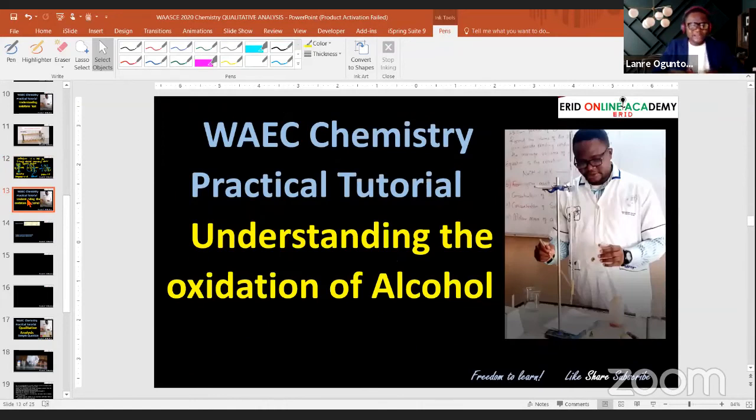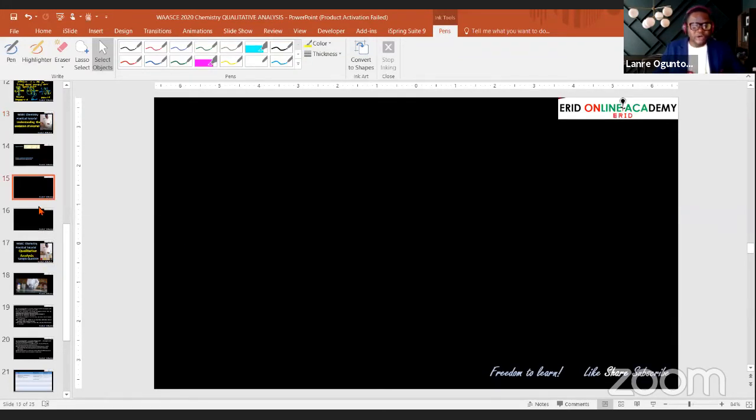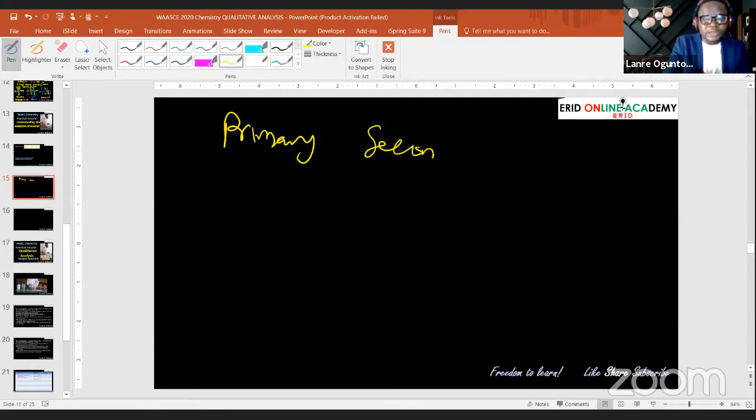Another test that you will need to understand is the oxidation of alcohol: how your alcohol will be oxidized. From the example that we have said, Ida told us that we have primary, secondary, and tertiary alcohol.